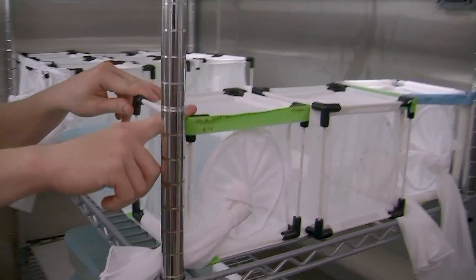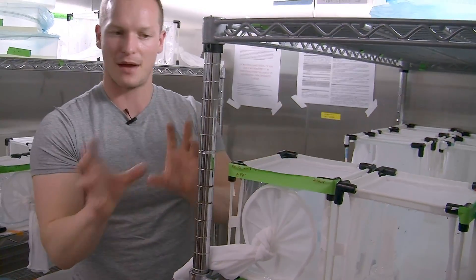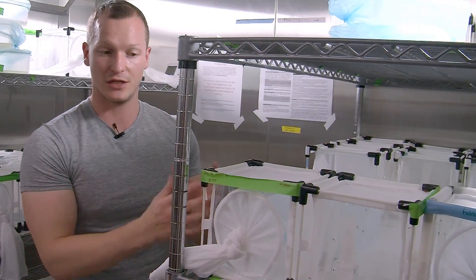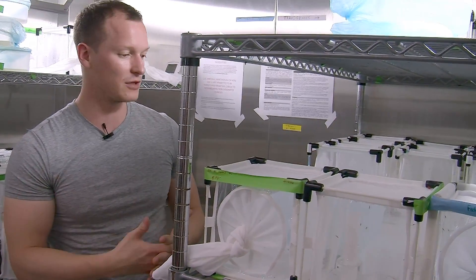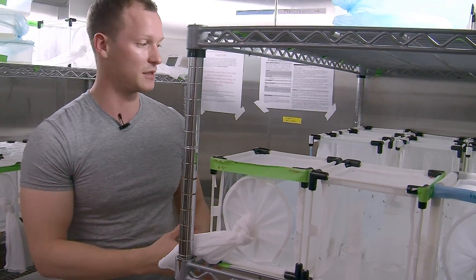Once we have our transgenic mosquitoes that contain the gene drive, we want to separate them into males and females and mate these to wild mosquitoes. We want to see if we have a heterozygous gene drive mosquito, does it transmit its gene drive to half of the offspring or to more than half? We obviously hope that with the gene drive it's going to bias its own inheritance and that the majority of the offspring will contain the gene drive.